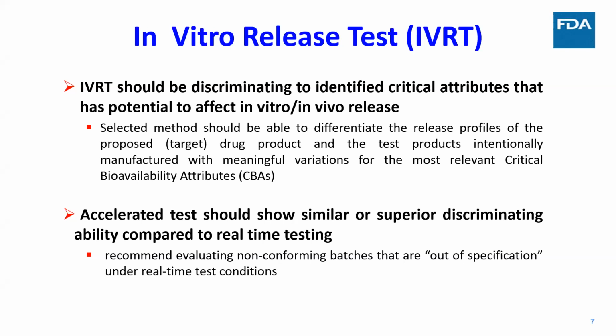Accelerated tests should show similar or superior discriminating ability compared to the real-time testing. And it is recommended to evaluate non-conforming batches that are out of specification under real-time test conditions, if available.